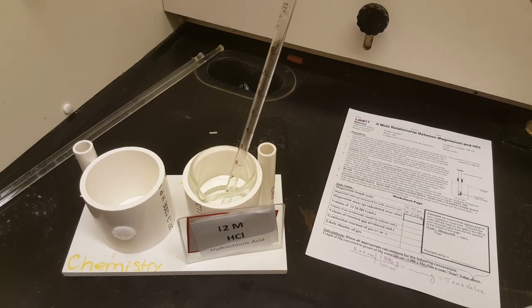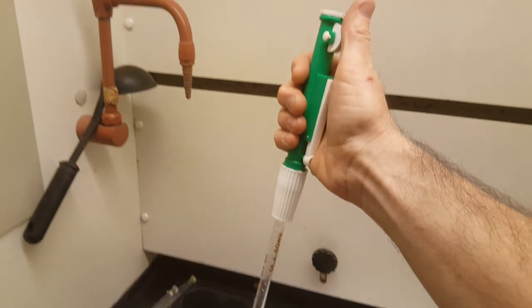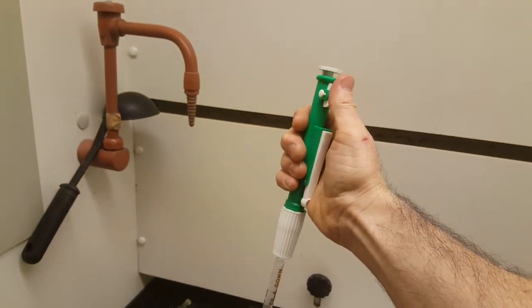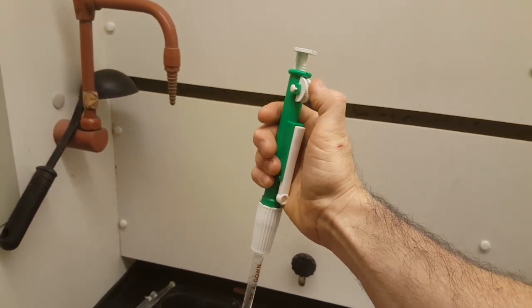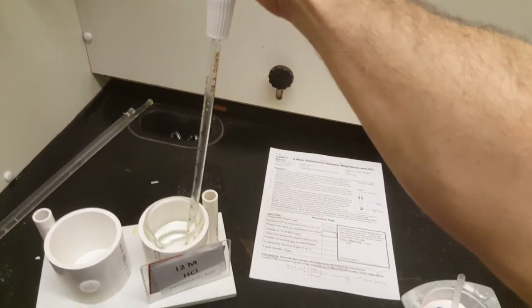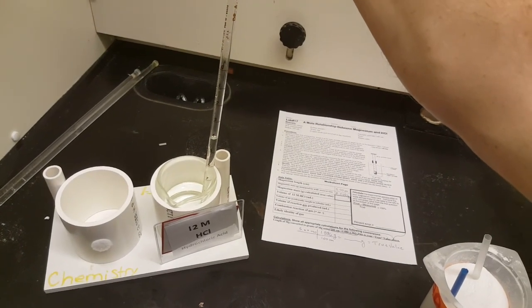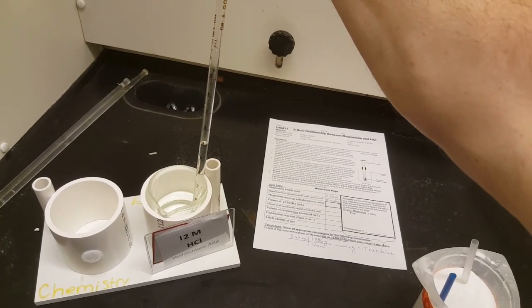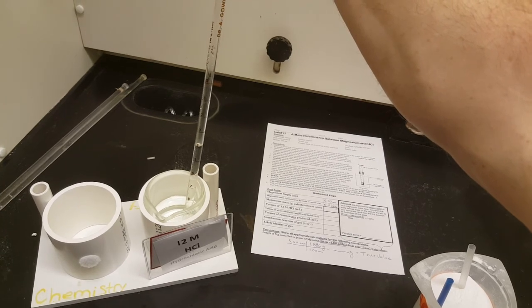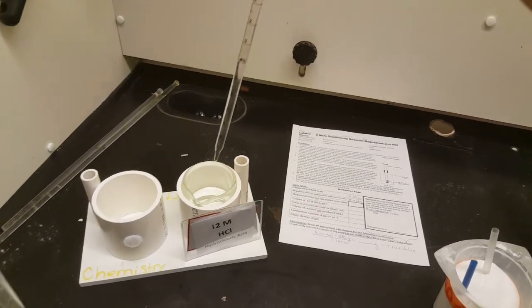So to fill the pipette, you need to roll your thumb down and the plunger will roll up and your pipette will fill. Fill it until the 4 mark. Make sure that that meniscus, or the dish of the acid, is sitting right on the 4.